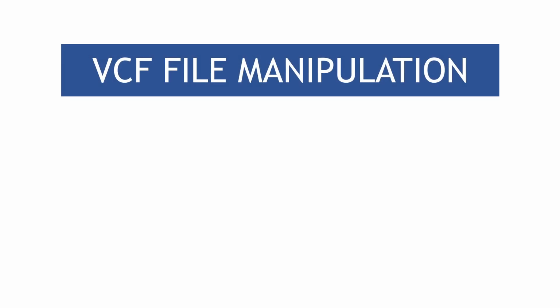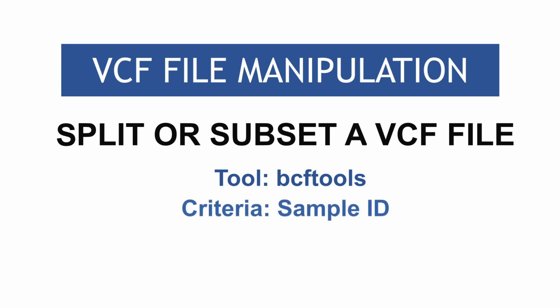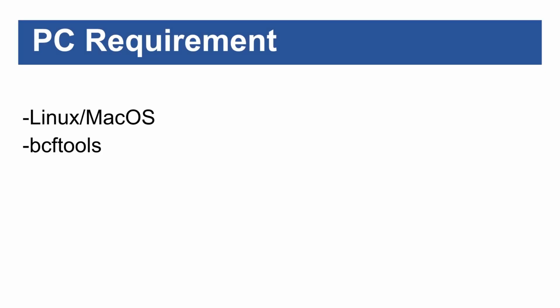In today's video, I am going to show you how you can subset or split VCF files using the tool BCFTools. And the criteria for splitting or subsetting for this tutorial is the sample ID or the sample name. And so, in order for you to follow this tutorial, you need to make sure that you have installed BCFTools on your PC. That is the only requirement for this tutorial.